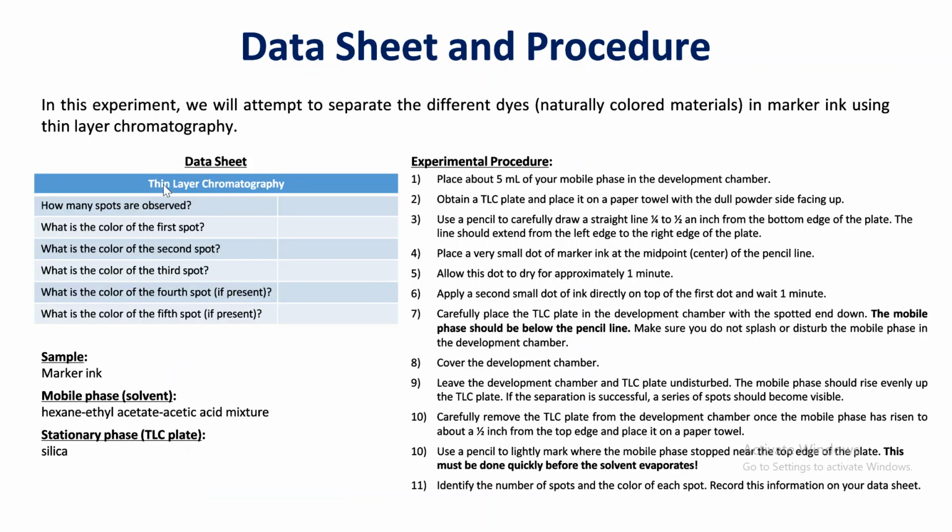So for your data sheet, this experiment, we are going to try to separate different dyes. Now, these dyes are all present in the same marker, and these are naturally colored dyes that are present in the marker, and we're going to be using thin layer chromatography. Make sure as we're going through the video, you answer these questions.